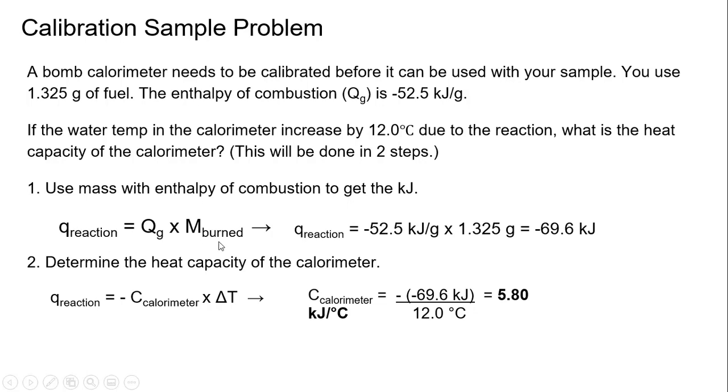So I've given you the formula, and these are all in your PDF. This is the energy density, which will cover the mass that's burned. So that's what was combusted, and you set them up. You should know by now that Q reaction is in joules or kilojoules, and my answer ends up being in kilojoules.